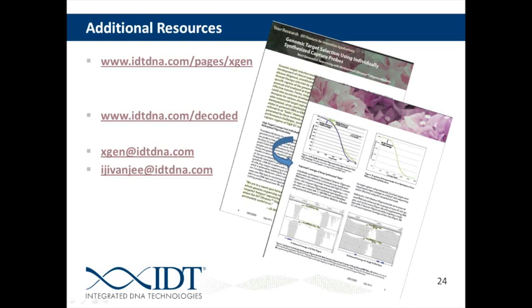Okay. All right. Adam, here's a question for you. This is getting a little bit away from the target capture, but it's also still enrichment. If you're doing PCR for enrichment, how many cycles can one do of PCR in order to minimize the bias arising from PCR enrichment?